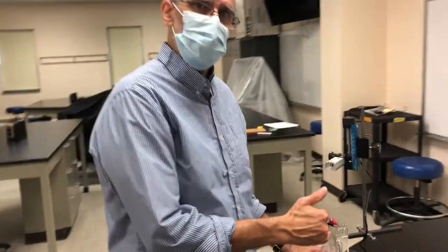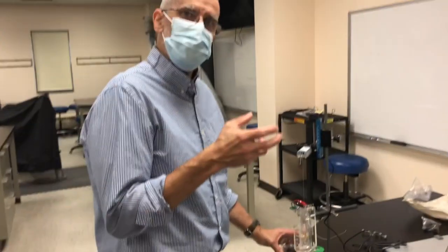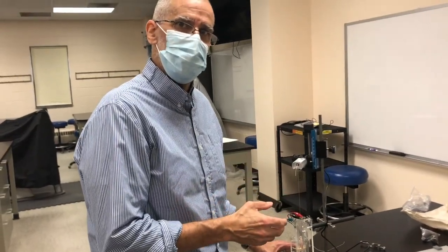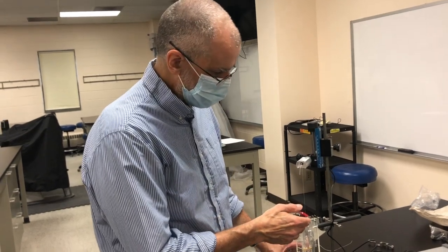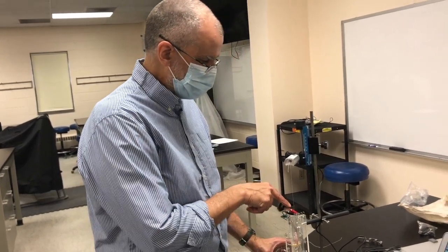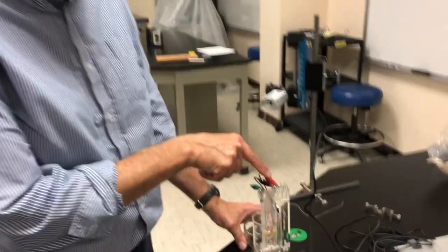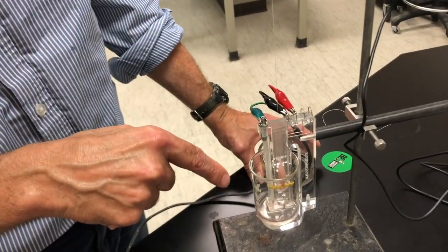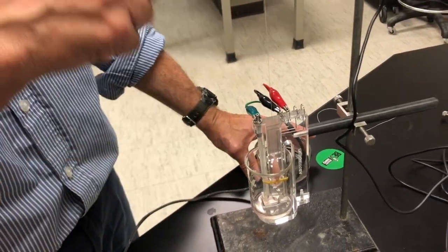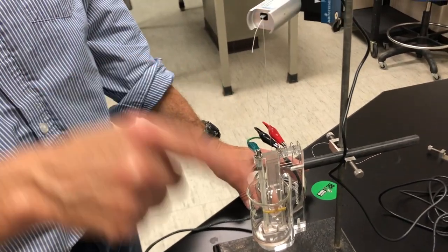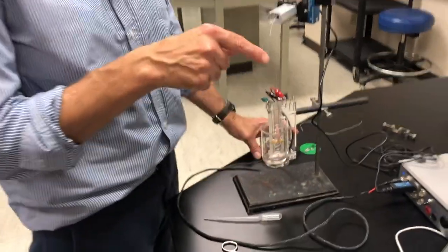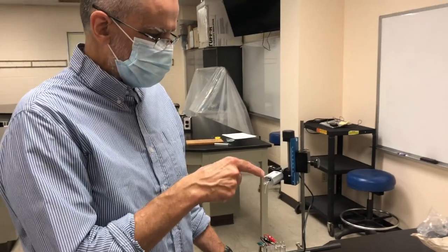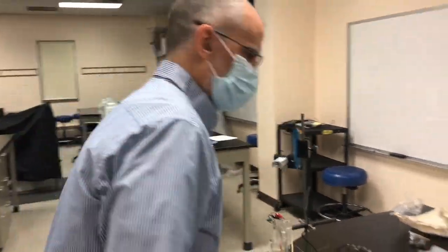Now the muscle isn't really allowed to contract fully, but it does generate tension. So this is an example of an isometric contraction. We've got the stimulator cables over here and we're going to change the nature of the stimulation such that we change the strength of the twitch.